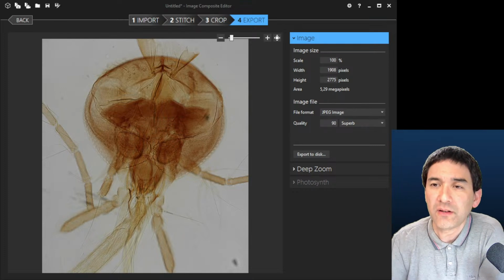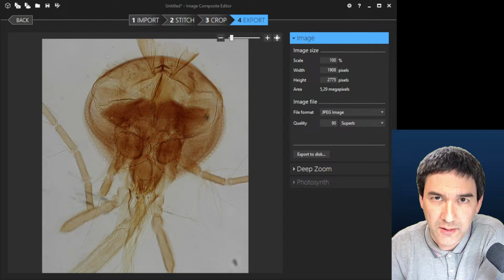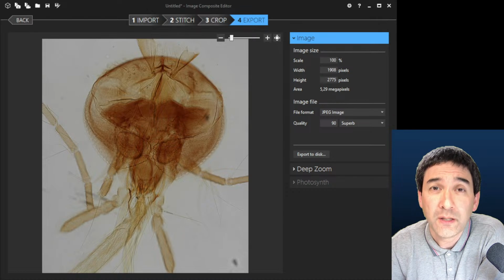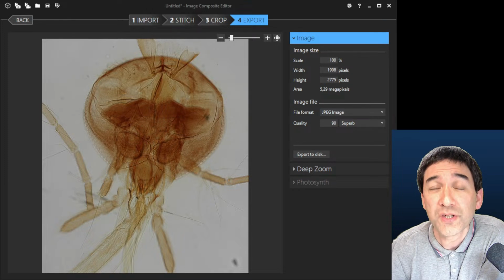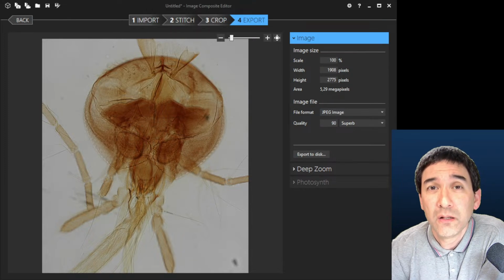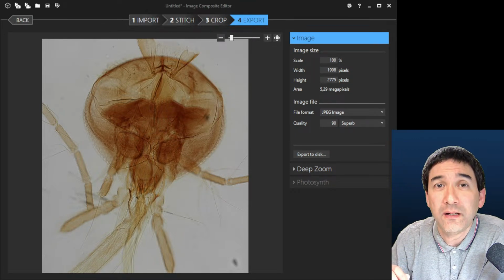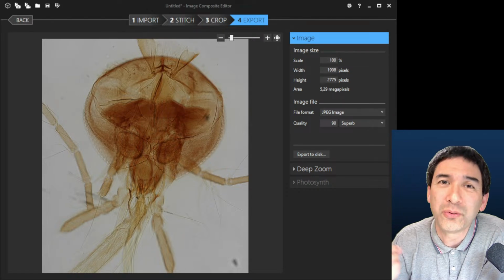So basically the thing is the following. If you want to magnify something, then you have to go up with the magnification of the objective. Because if you do that, then you also increase the resolution. What you do otherwise is the following. If you just say, I'm going to use a low magnification objective and a high magnification eyepiece, then the image is going to be larger, but it's going to be more blurry. So you don't gain anything.